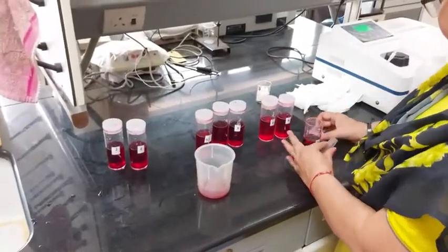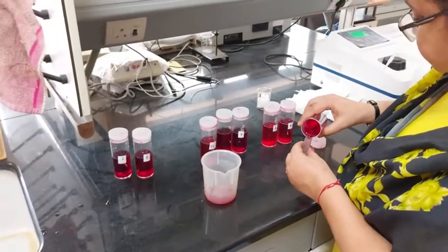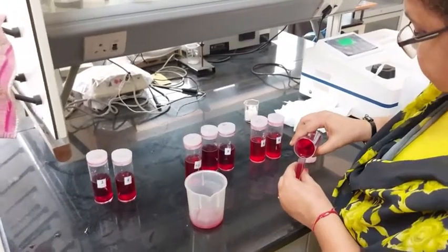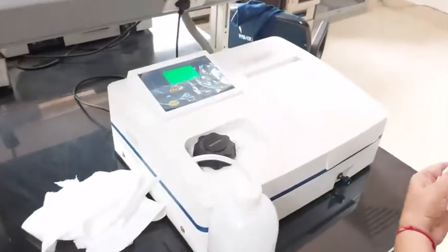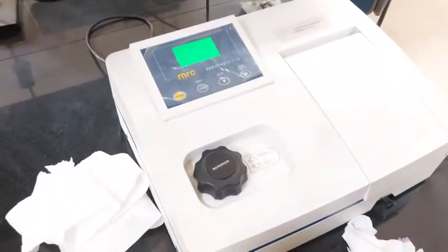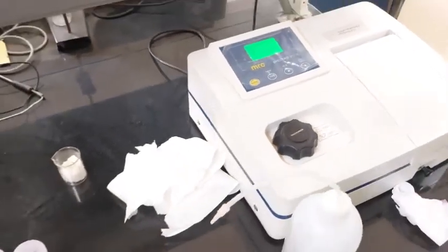Then the third standard, 0.8 milligram per liter, is 1.005.